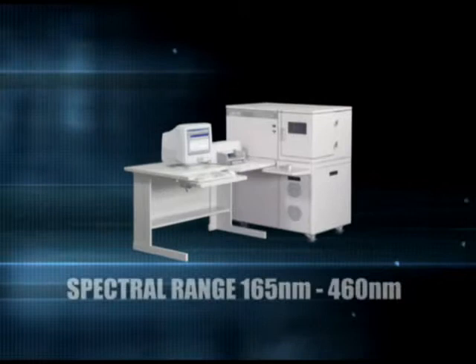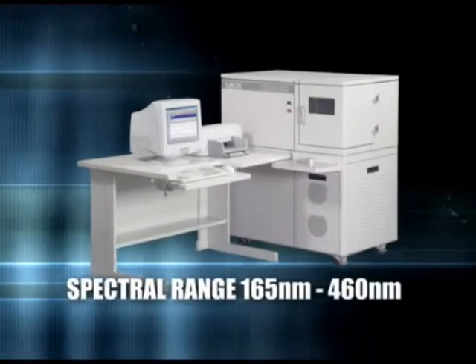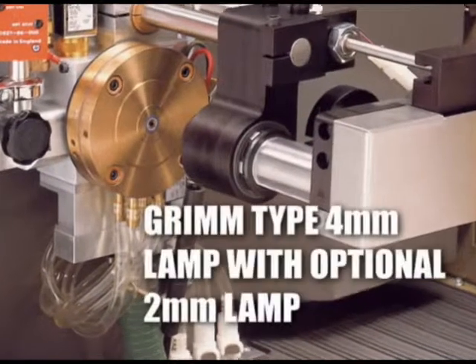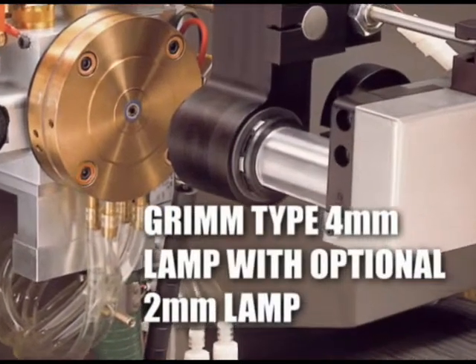The GDS500 spectrometer features a spectral range of 165 to 460 nanometers. Featuring a standard 4-millimeter target area with an optional 2-millimeter target lamp, the Leco GDS500 can accept a wide range of sample materials.